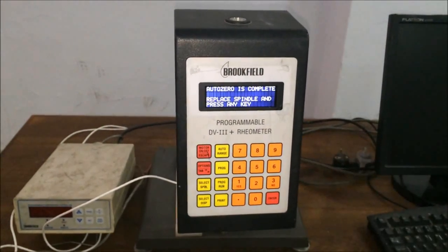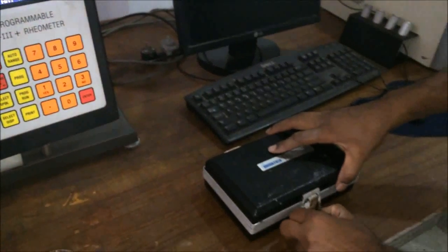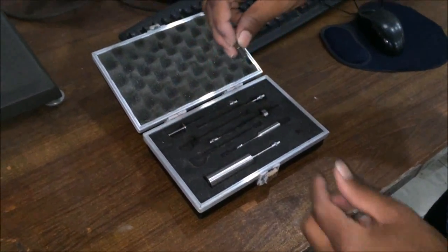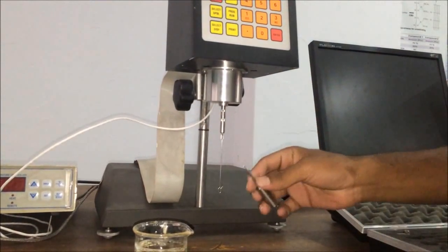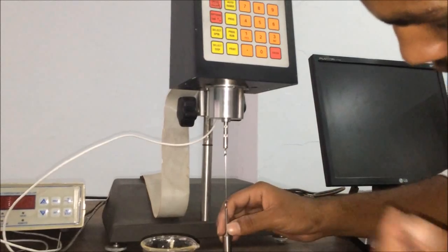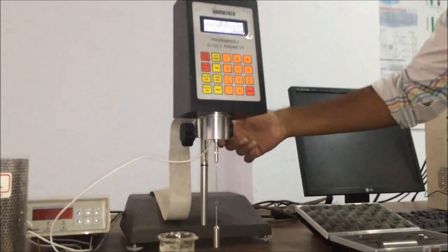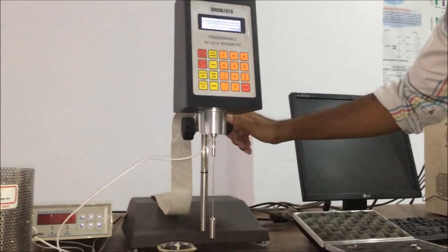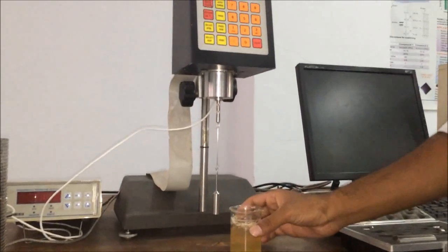Auto-zero is now complete. The screen shows to place the spindle and press any key. We will now replace the spindle — our spindle holder is fixed and we will place our spindle LV27. Now we will move the motor up with the help of the adjustable stand, and after this we will place our gelatin.